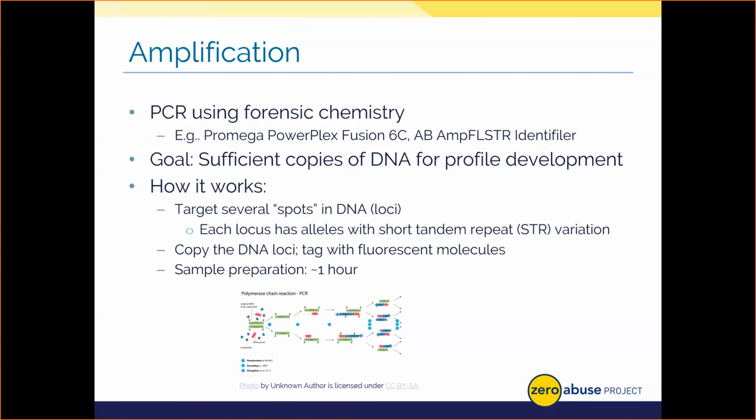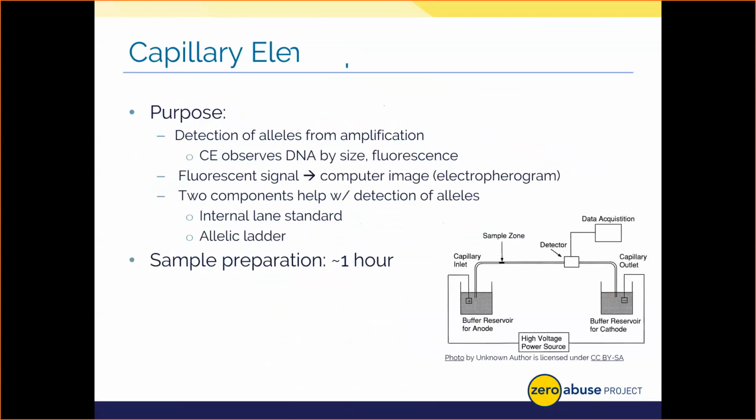So the entire PCR process of thermal cycling and the heating and cooling to make new DNA copies really takes about an hour. And then it should take on average 1 to 2 hours based on how long it takes to get the samples prepped. The good news is that you can do dozens of these samples at once and batch multiple cases. So let's move on and talk about capillary electrophoresis.